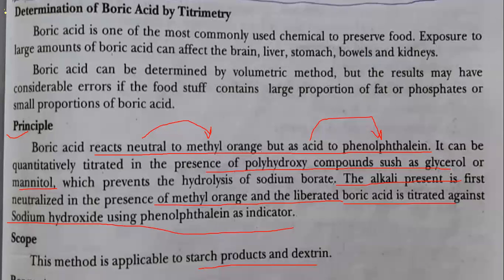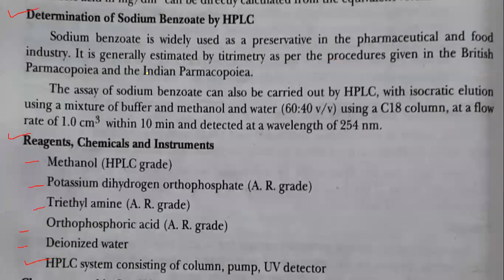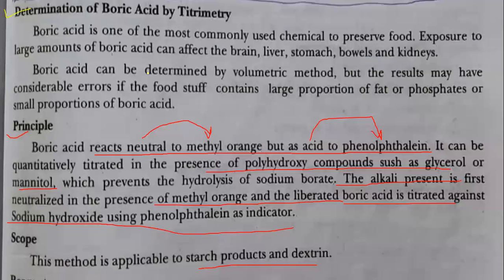Hello everybody. Now in this lecture we are going to see the determination of boric acid by titrimetry and determination of sodium benzoate by HPLC technique. Okay, so first we will see the determination of boric acid by titrimetry.